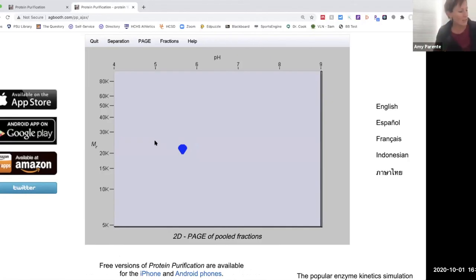So one of the things you'll have to write down here, there's a spot here that says, tell me something that wasn't successful and why you think it wasn't. Well, when I did that step that did the affinity chromatography, it didn't do anything, but that's because all of the proteins had a his tag. My stuff wasn't different from everything else that was still in solution. So I could put that down in that area for something that didn't work, and I understand why.